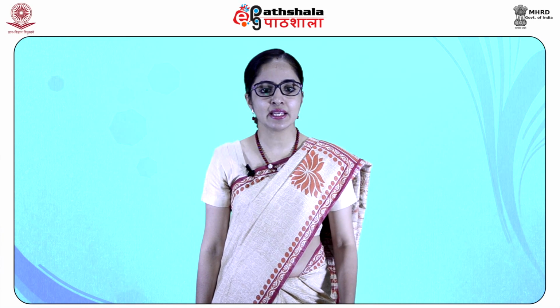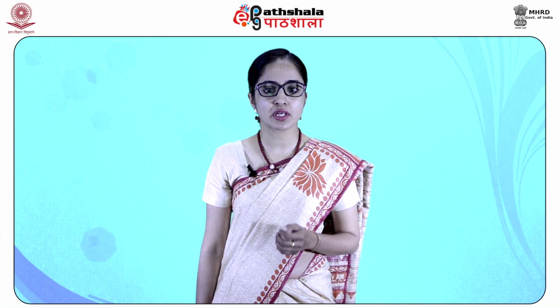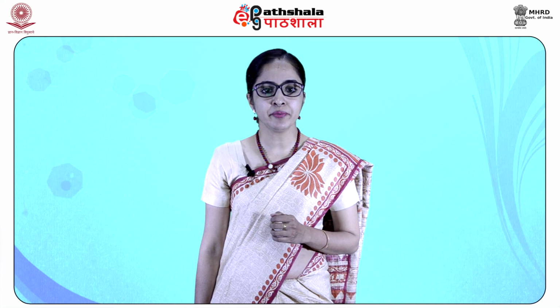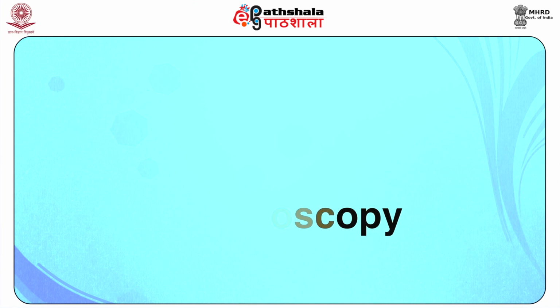Now, unlike in other types of spectroscopy, NMR requires high attention while preparing a sample, because the quality of the sample has a profound effect on the performance of the corresponding spectrum. Therefore, simple but necessary steps should be followed to prepare an NMR test sample. Now let us begin with the details of instrumentation of NMR spectroscopy.